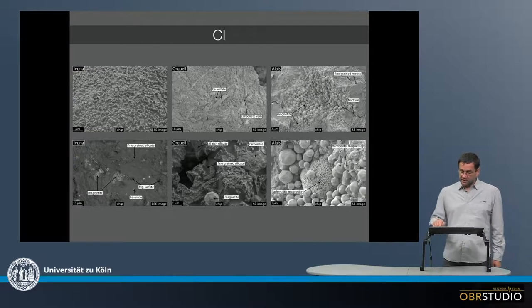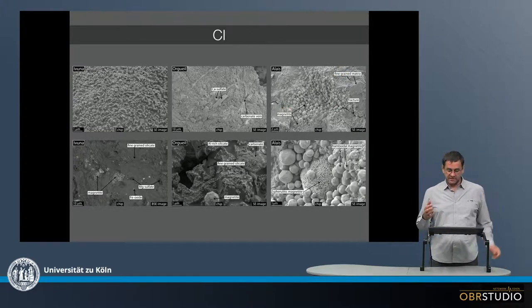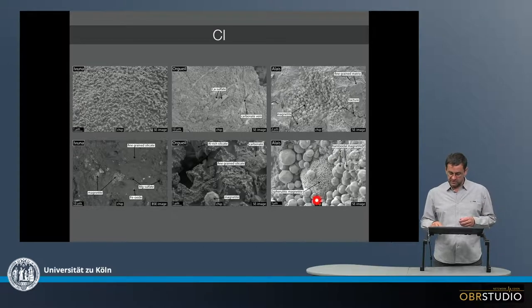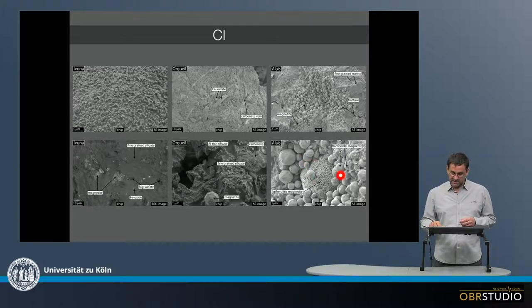And finally there's Alais, and some larger nests of these magnetites, which are quite often found, or this spherulitic magnetite, larger one inside the smaller grains around here.